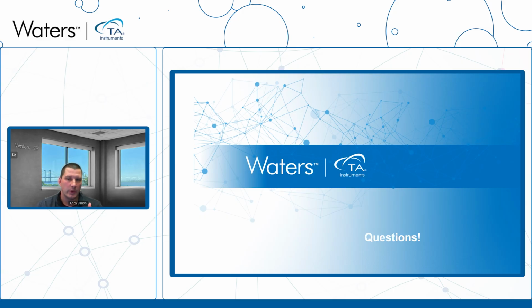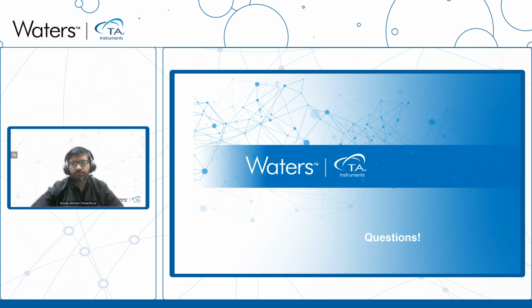And when you get into real parts and complicated molding behaviors, when you need to quantify that, our recommendation is to find a way to get the real part in a test instrument somehow, because we can still apply very repeatable loads and displacements, but to the real part that experienced the real molding process. It's not always easy, but it is definitely the way to get the most accurate measurement of the performance of that component. So hopefully that answers that question.